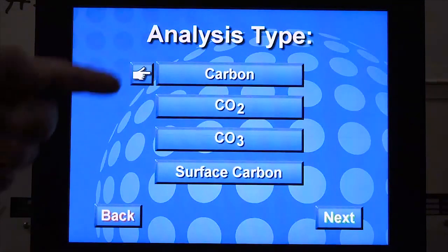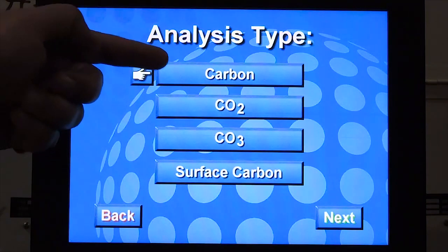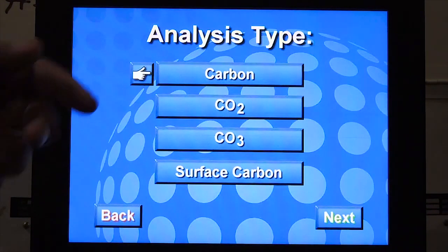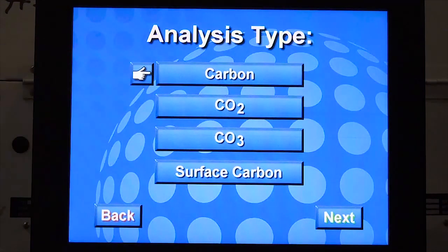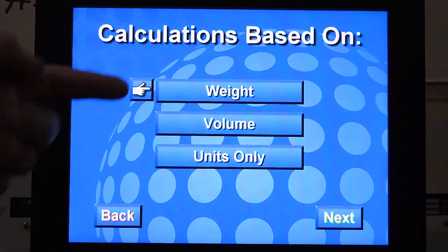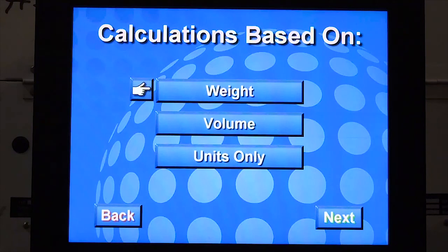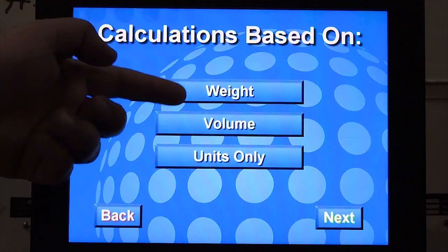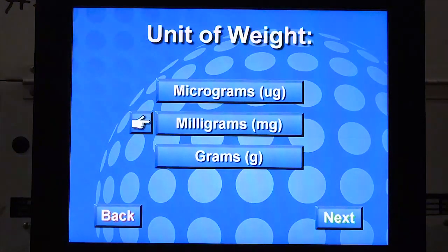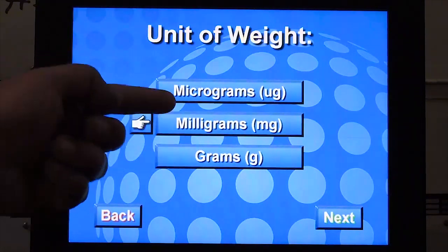Here you can choose the form you'd like your final results to be calculated in. If you choose carbon, the results will be presented in the form of percent C, percent carbon, or you can choose percent CO2 or percent CO3. Based on the type of your samples, you can choose initial sample measurements entered by weight, volume, or units only. If the units only option is selected, results will be presented as amount of carbon in micrograms. The units range from micrograms to milligrams or grams; here we choose milligrams.